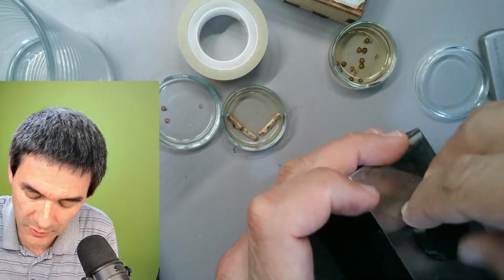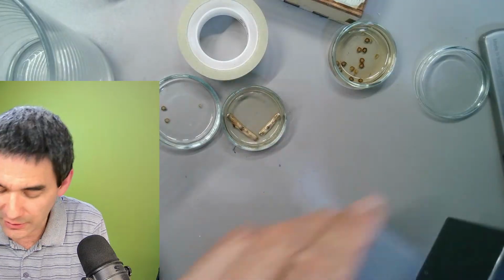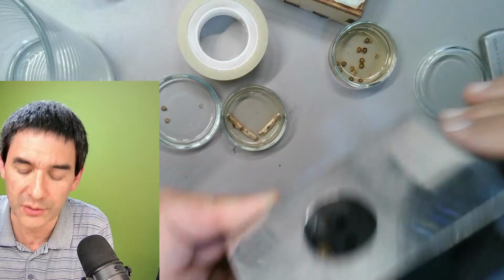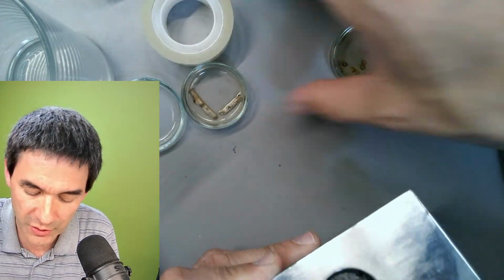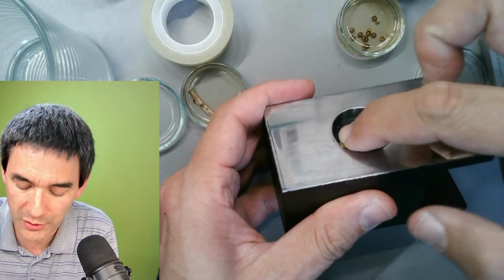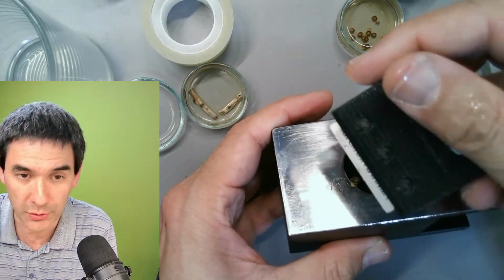I think last week or 2 weeks ago I actually demonstrated this to you. Okay, and then you know what? I'm just gonna make 1 or 2 cuts. It's not stable, okay, because it's not clamped, right? Just for the sake of demonstration, and now you know why I've actually put it to the side, because it's a little bit of a support. And then, I better not cut myself now.